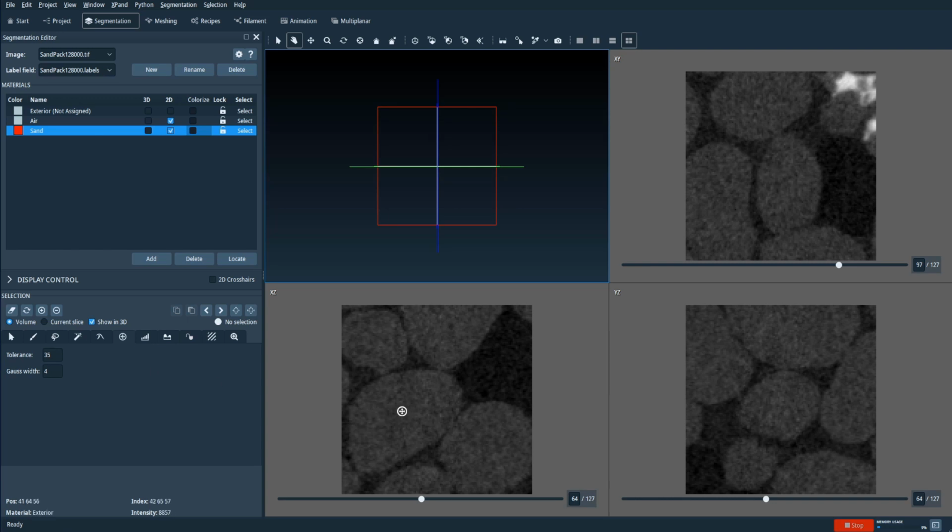To use the blow tool, you first click on your slice to specify the starting seed point, and slowly move your cursor away from the point while holding the left mouse button. As you move further away from the starting seed point, your region starts growing. Once you release your left mouse button, all the pixels inside the contour of your region get selected, as you can see here.